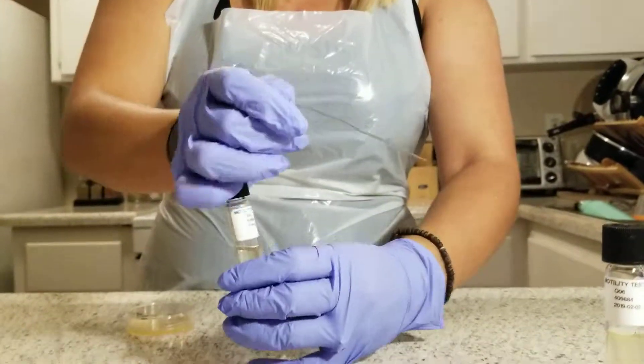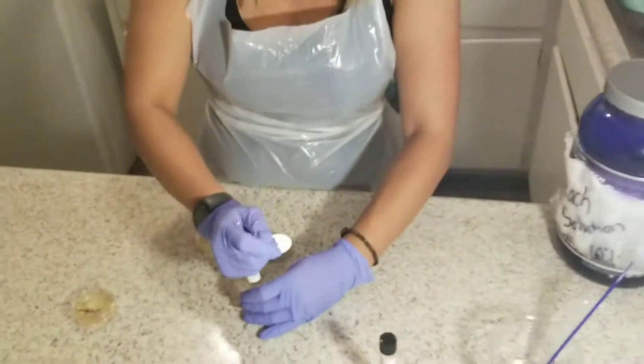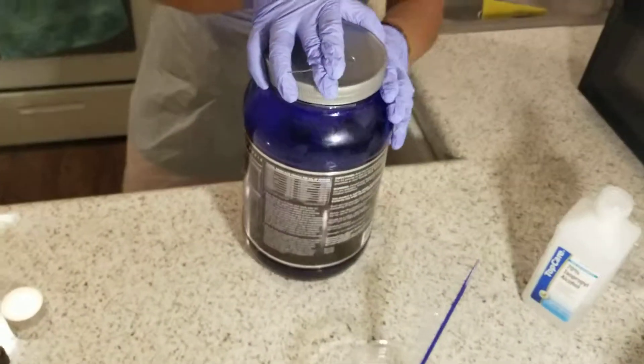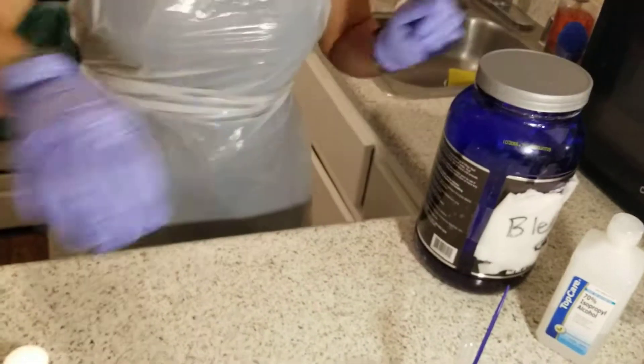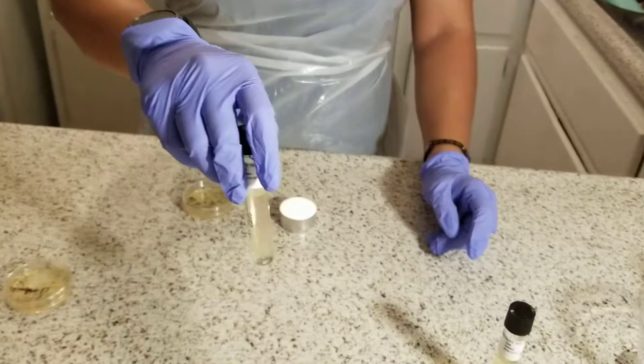I place my paper clip in the 10% bleach solution. Then I put my motility tube in the incubation location for 48 hours.